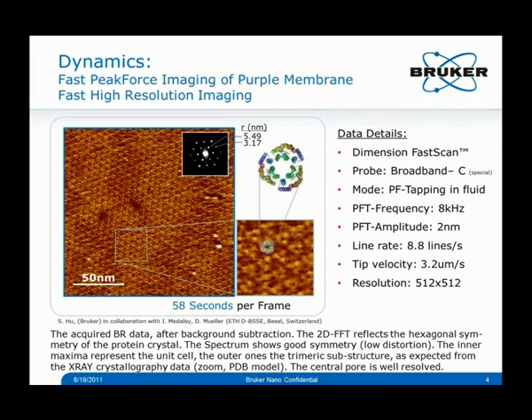When you compare this to our effort, the time and effort that went into that high quality image in total is probably on the order of 1,000 times higher, so it can be assumed that that is the absolute limit of achievable resolution with current techniques. While in our image we actually can't assume that. This was a pretty quick effort and probably represents by no means the limitations of the technique.